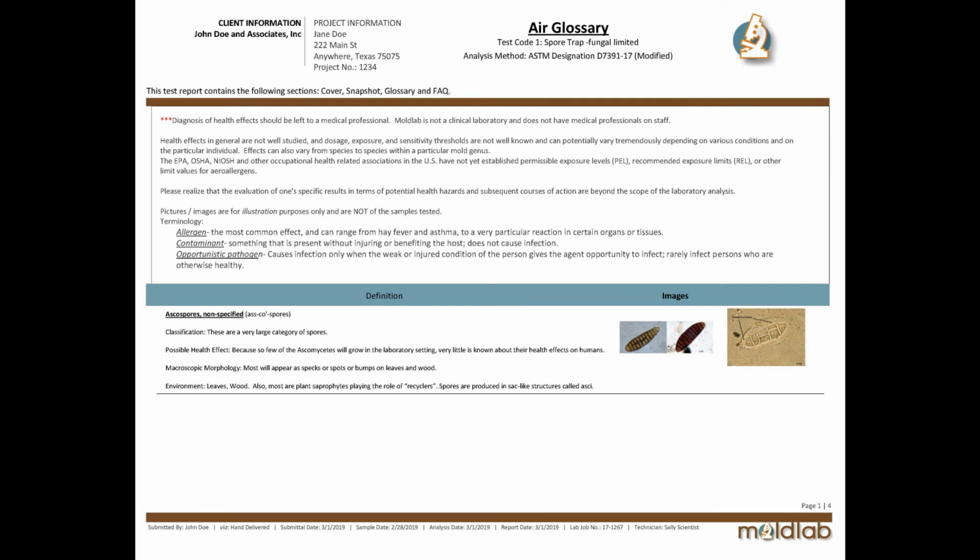Now we can move on to the next report section, the glossary. This section lists each identified mold type from the report and provides some information about it. Classifications, health effects, appearance, and environment are discussed for most mold types, along with example images of the mold under the microscope where available. However, any health concerns should always be discussed with a physician.